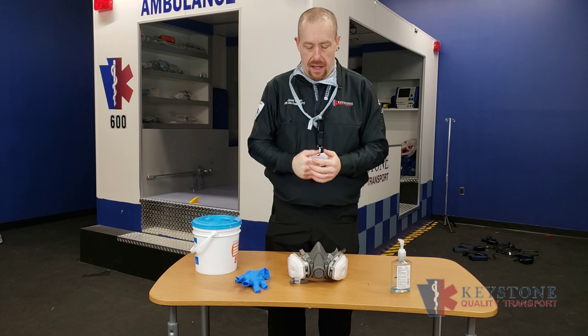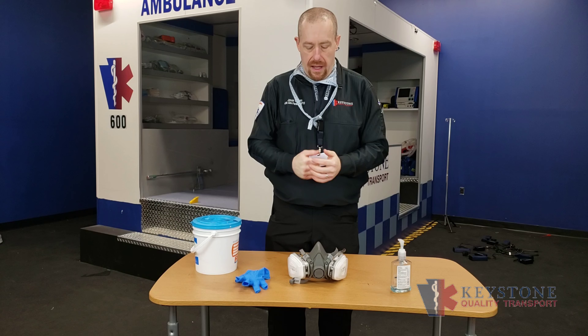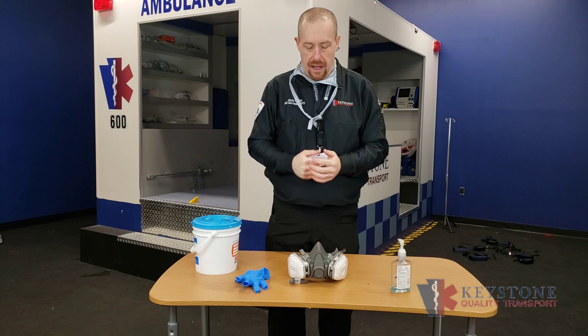Good day. My name is Jason Winters. I've been asked to speak to you today about the cleaning and storage of the 3M multi-use respirator following a patient contact.